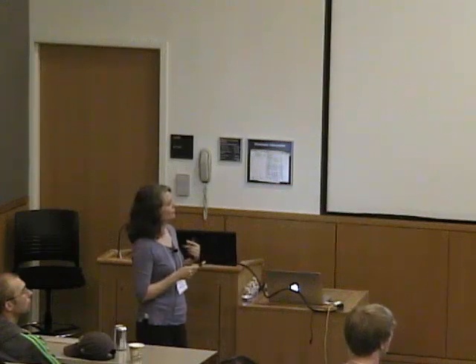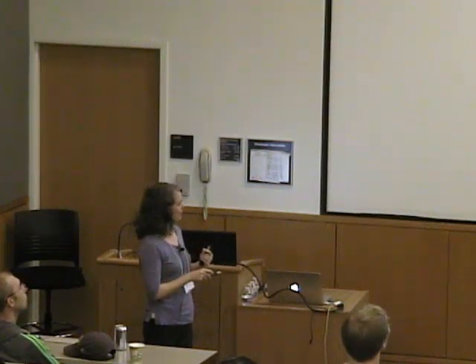So this then was developed into an iterative approach for refining solution structures. All right, so what you can do is you can first determine your chi-tensor parameters from your pseudo-contact shifts, and then feed that information into your structure that you're also calculating, and do this iteratively until your chi-tensor converges. And when your chi-tensor converges, you have a nicely refined structure.